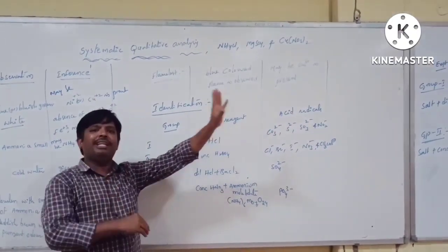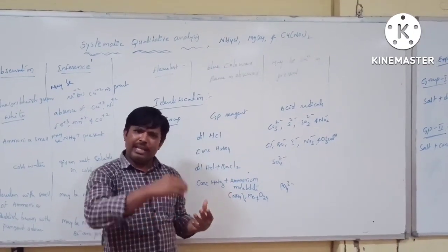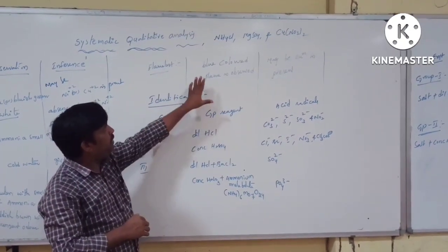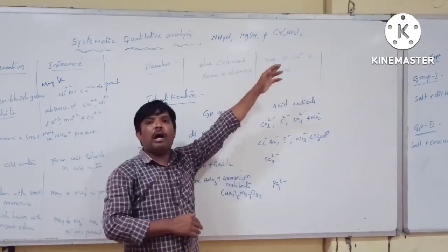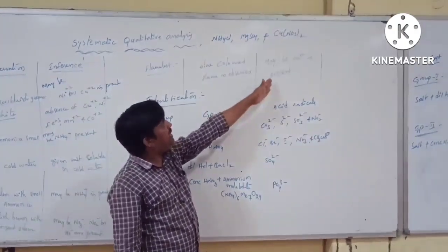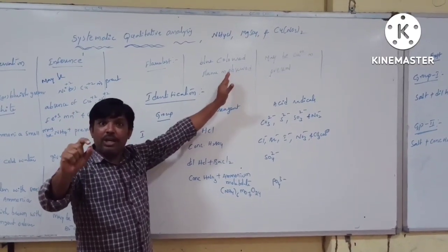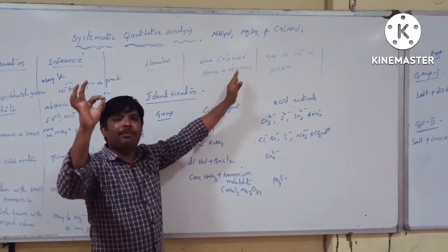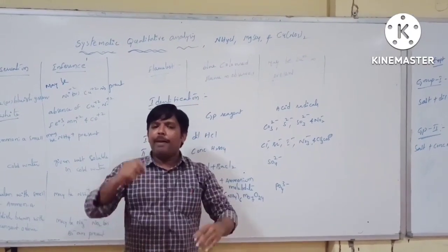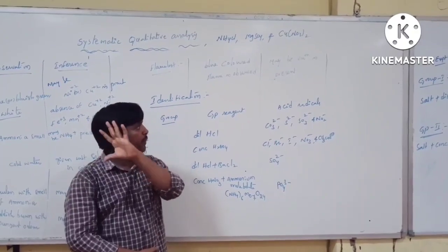Okay, what are the remaining colors? If it is brick red, calcium. Strontium is crimson red. There are some other colors also, but we do not need those cations. We observed a blue flame, so maybe copper is present. Copper లేదు అనుకోండి, మేబీ అమోనియం మెగ్నీషియం ఉన్నట్టు కదా, కాబట్టి మెగ్నీషియం అని మనం ఐడెంటిఫై చేయలేము కాబట్టి no characteristic colored flame is observed. Simply we have to write: no characteristic colored flame is observed. Calcium, strontium, barium, copper, manganese, zinc are absent. You have to mention clearly that they are absent. Okay, that is the flame test.